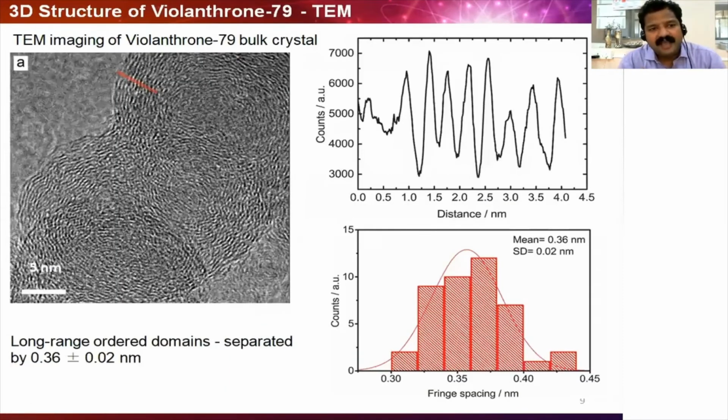So we see how these molecules arrange in 2D. It's also important to see how they are arranged in 3D. Because in AFM, this is also important, as we would like to verify the structures we observe with AFM with an independent complementary technique.